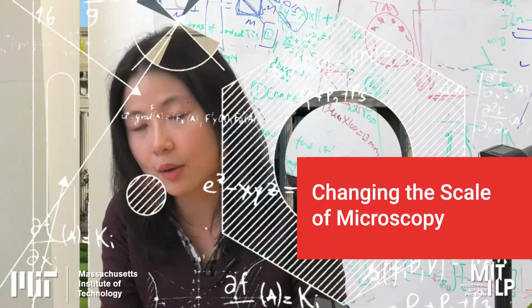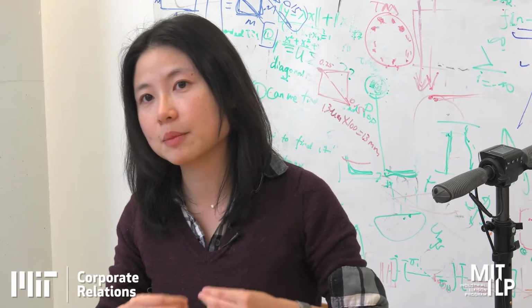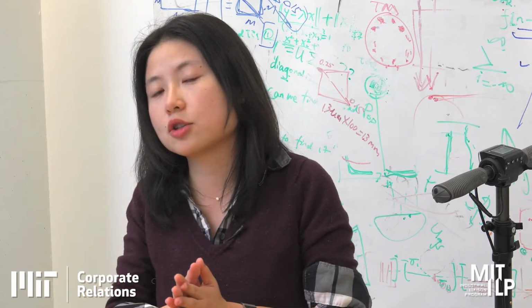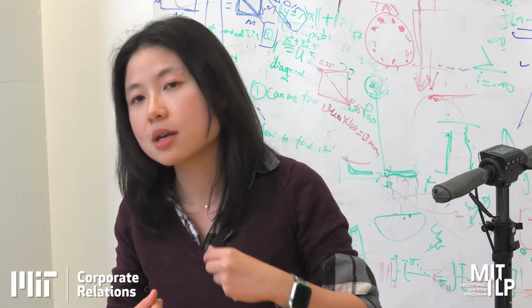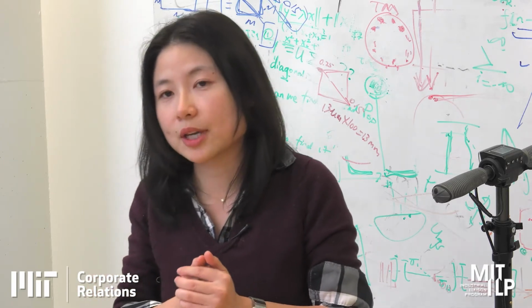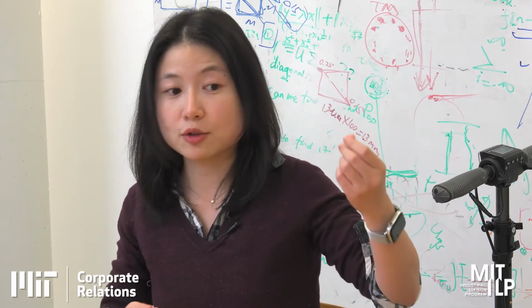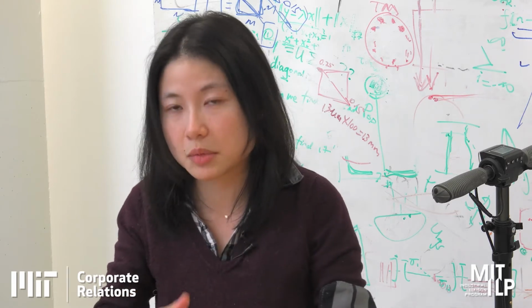One project that we're really excited about and in the beginning phase of development is to develop this fiber-based miniaturized microscope. So one thing we could do is to use it like endoscopy, but that gives you a microscopy resolution. So you can imagine we can use this for small animal experiments so that you don't have to euthanize animal every time you do an experiment.